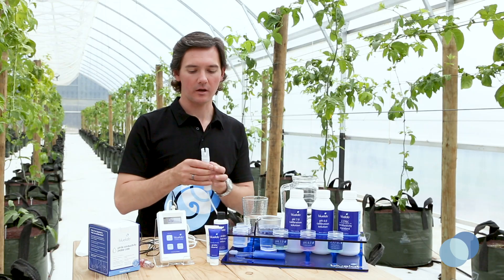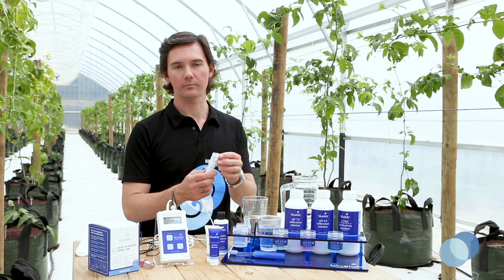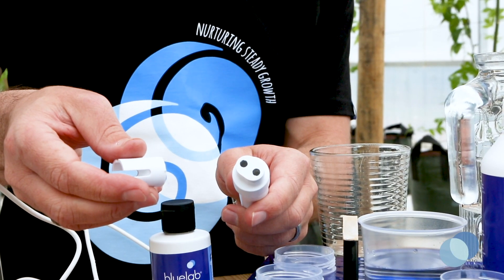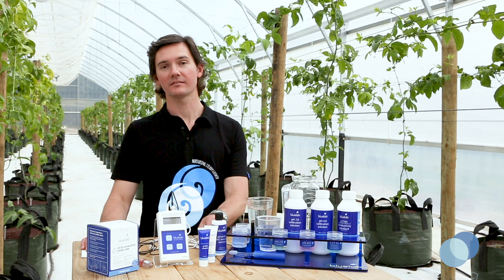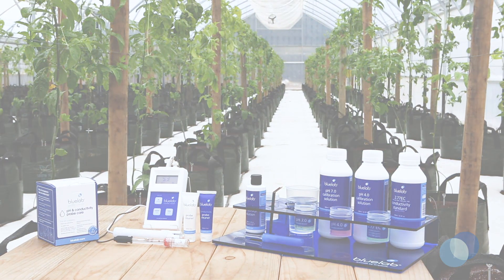Put the shroud back on. Be sure not to touch the face of the probe with your fingers, as you could contaminate the probe and cause improper readings. There are many PPM and EC testing solutions available on the market, but for best performance, use Bluelab calibration solutions with Bluelab products to ensure the highest levels of accuracy.